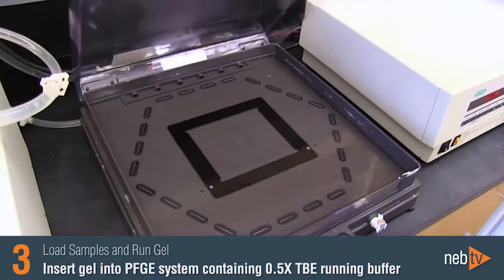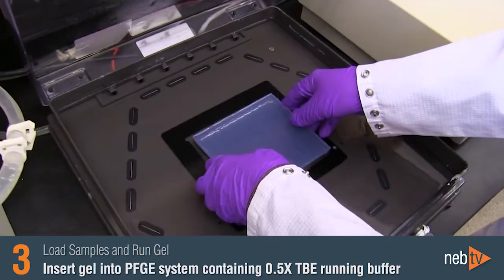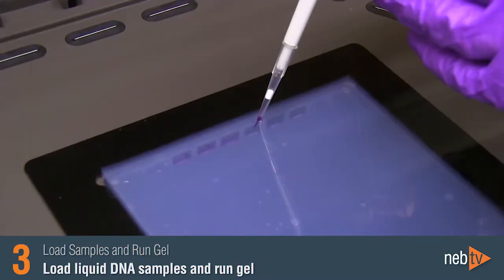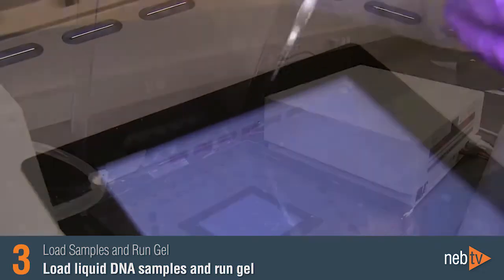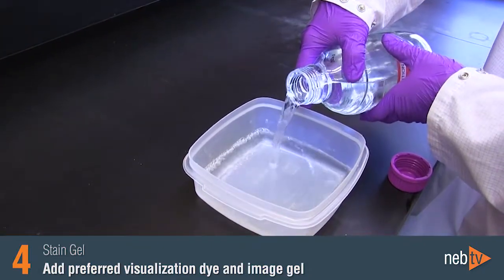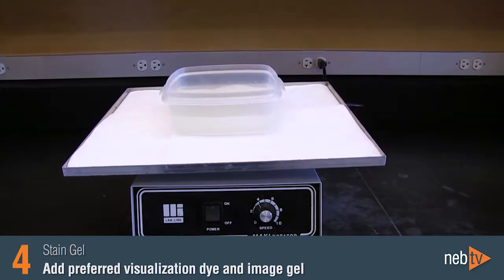Once the wells have solidified, your gel is ready to be run. Insert the gel into your PFG system containing cooled 0.5x TBE running buffer. Load liquid DNA samples and run the appropriate migration program. When the migration is complete, remove the gel from the PFG system and stain it with your preferred visualization dye. Now you are all set to capture an image of your gel.